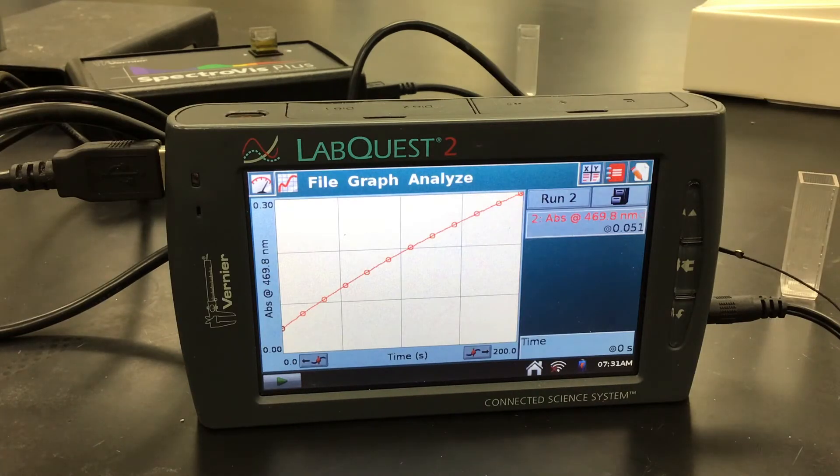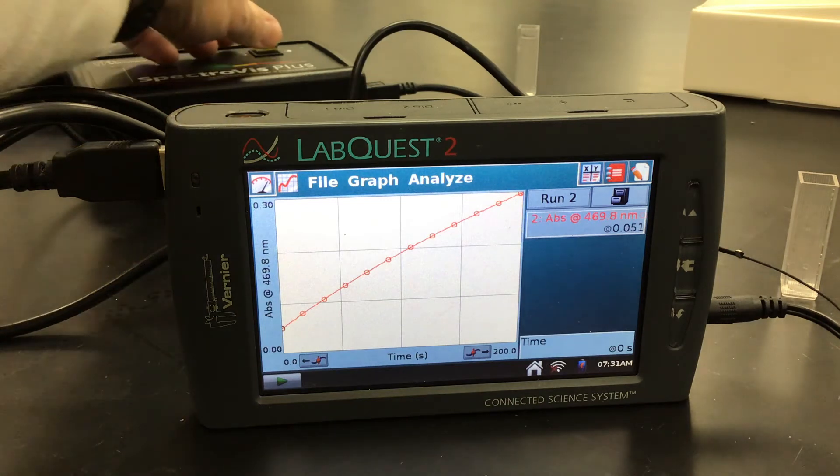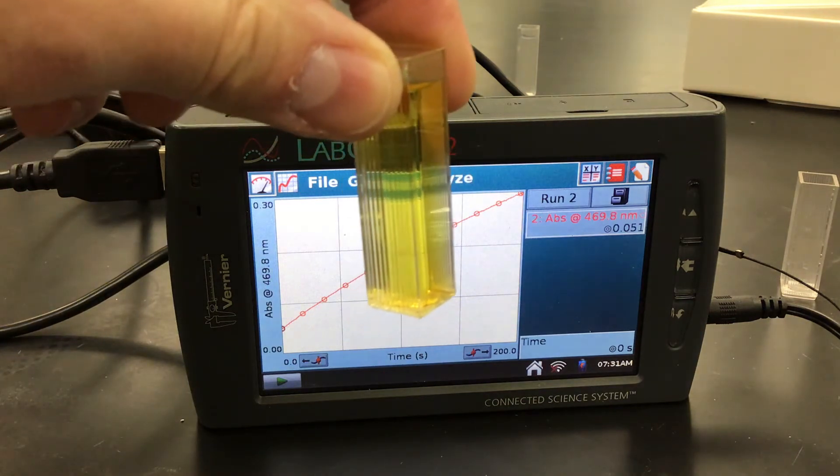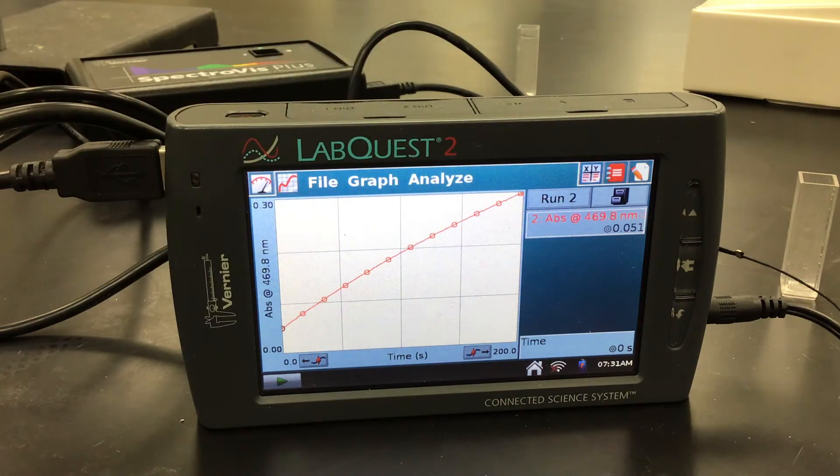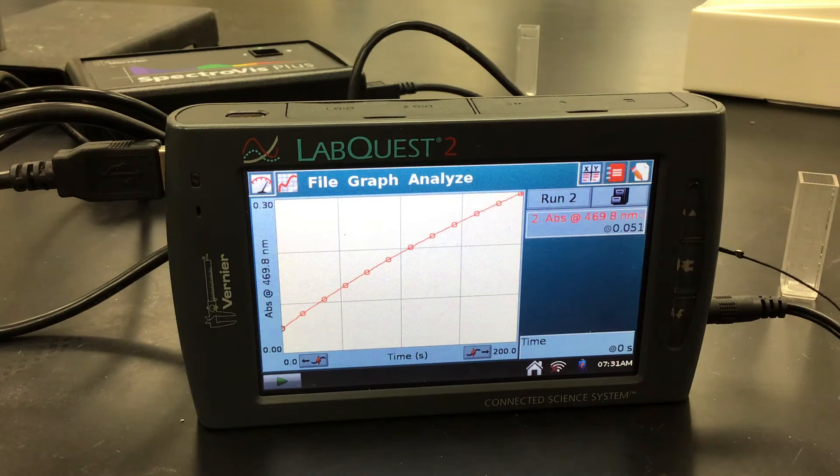All right, that's the finished graph of my second trial. And now we're going to do our third trial here. I'll take my cuvette out. Kind of see this definitely getting darker with time. For my third trial, I've got five milliliters of the iron three chloride, five of water and 10 of the potassium iodide. All right. So I'm going to mix those, pour them into a cuvette and go ahead and get started.